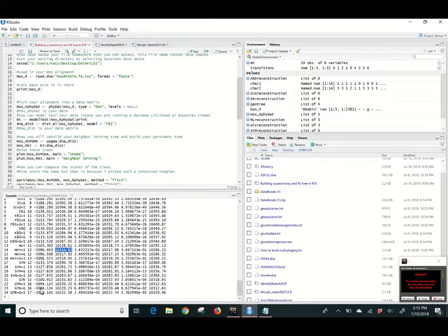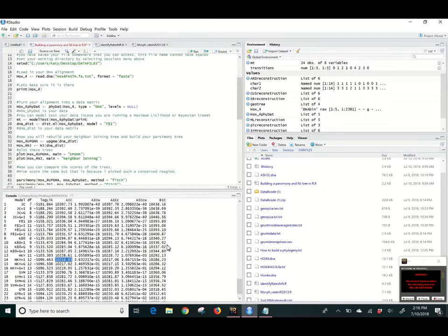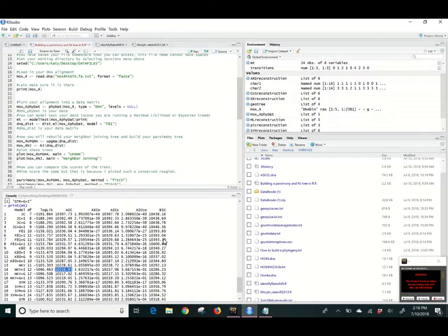Oh, these are lower over here for log likelihood. This one, HKY, is the lowest for that parameter. That matches up with that one fine. Yeah, so these jump around a little bit. Everybody kind of has differing opinions. There's other ways of looking at how well the model fits later once you've run it.